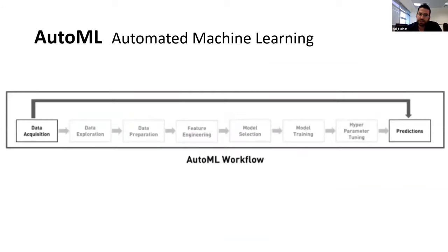So nowadays, there is a trendy buzzword, automated machine learning or AutoML, which enables non-experts to train high quality machine learning models. AutoML helps us find the optimal solution in an efficient way. As we can see, the AutoML framework automatically does all the tasks that we need to do manually. It cleans the data, creates features and does feature selection. After the pre-processing, it picks different models and trains many models on a given data set. Based on the model accuracy, it automatically takes the best model and then tries to increase the model accuracy by tuning the model parameters.